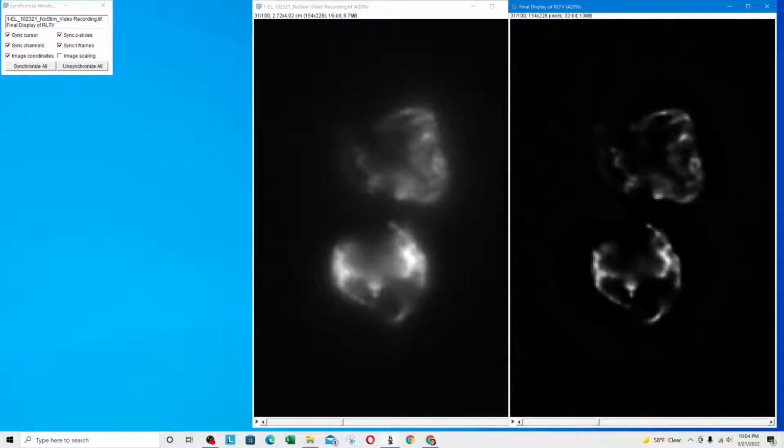The noise in the background has gone down. It's very easy to now separate the cells, and also very fine details about the structure of the mitochondria and how they're connected can be visualized and analyzed. Depending on what your application is, this could be incredibly useful.